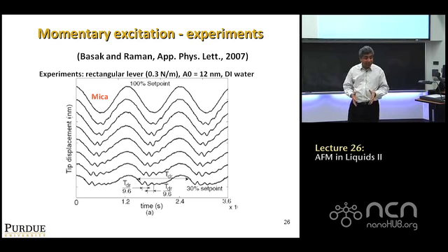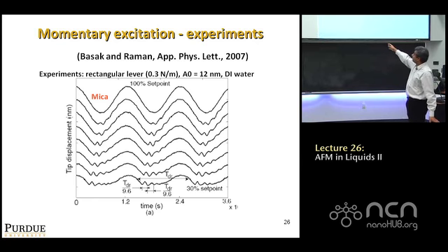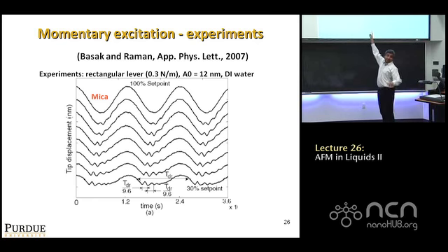And remember, the sound comes from the fact that after collision, the internal degrees of freedom are ringing, right? So if I bounce it here, or if I bounce it there, you get different sounds. So if you can map the amount of this ringing of these internal degrees of freedom, that's another way to map local properties. That's what one can try to do. This is a pretty specialized technique, but the idea is you're trying to capture these little ringing effects, or if you go back to Putman's paper, the distortions that he got at the bottom of the swing. You're trying to capture the magnitude of that as you go over a sample.